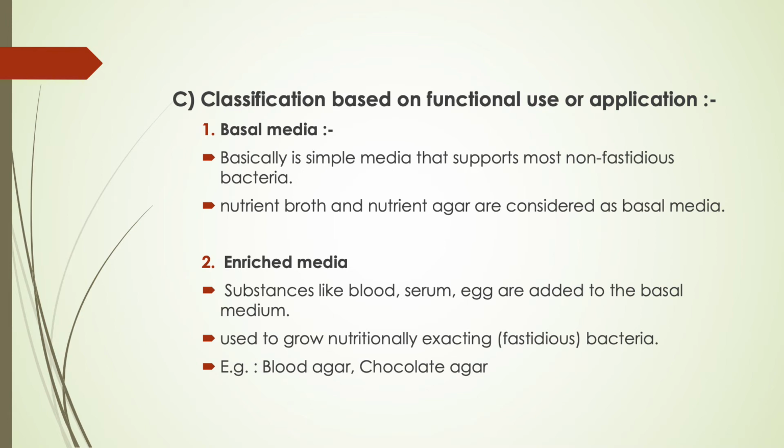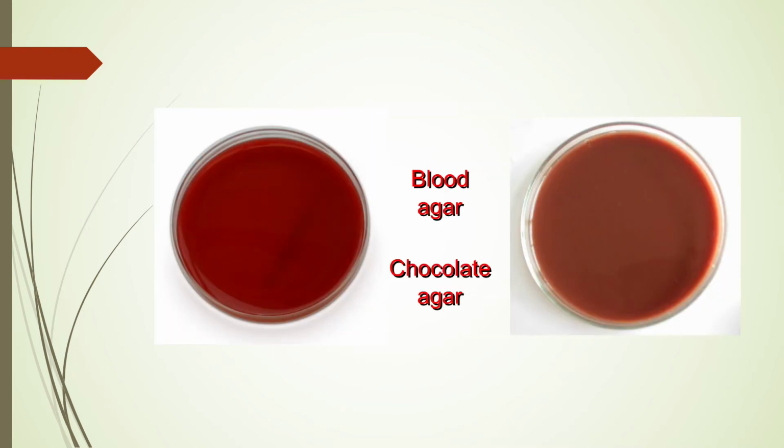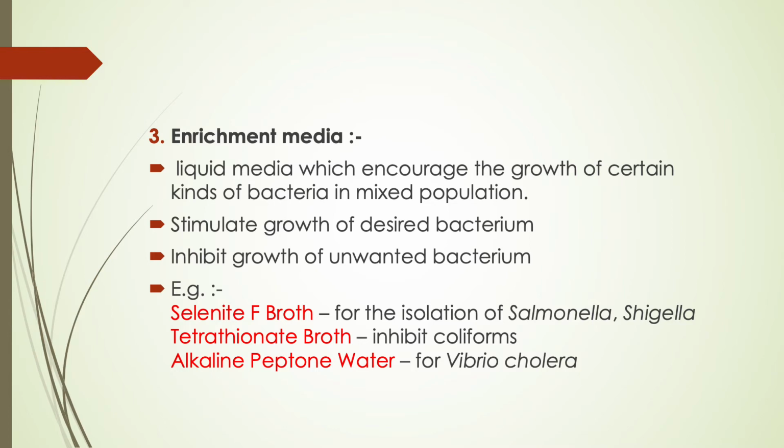For enriched media, for example, we have to add serum to that media to support the growth of the bacteria. So this is, for example, blood agar and chocolate agar. It's specific for some bacteria because it needs some specific proteins. And enrichment media is the same.